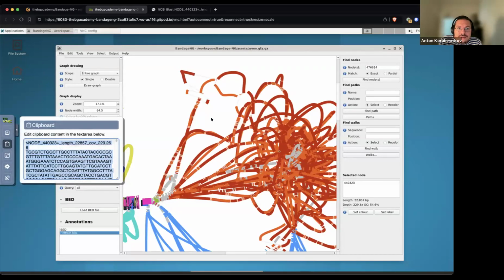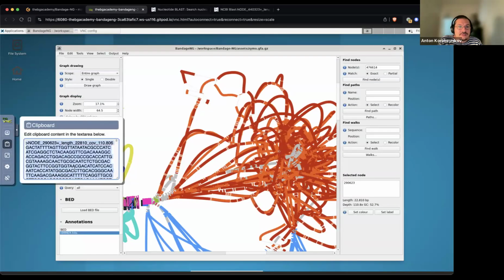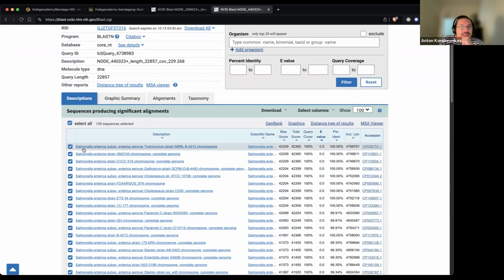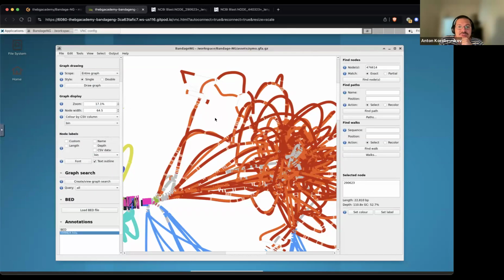And let's see what would be the next guide here. All right, so the first guy is definitely Salmonella enterica. Could you guess what might be the second species here that is pretty close to Salmonella in terms of genome organization? It shares a lot.